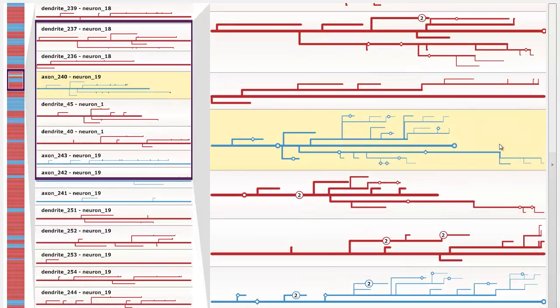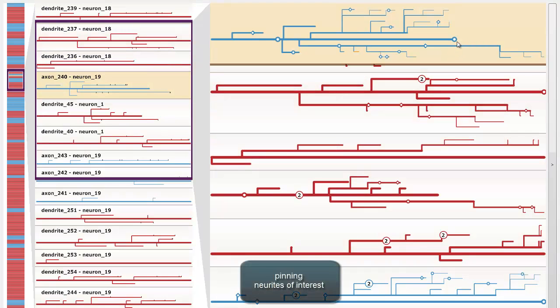If users are interested in a certain neurite, they can pin that neurite to the workspace. This guarantees that it stays visible, even when the remainder of the view changes.